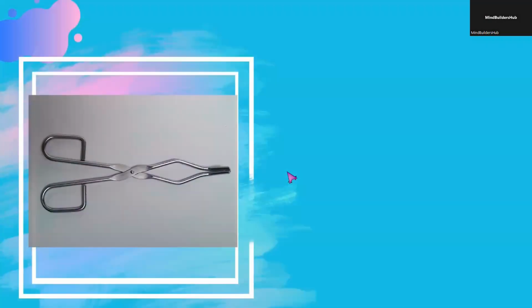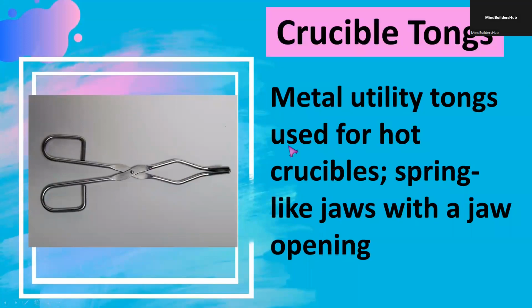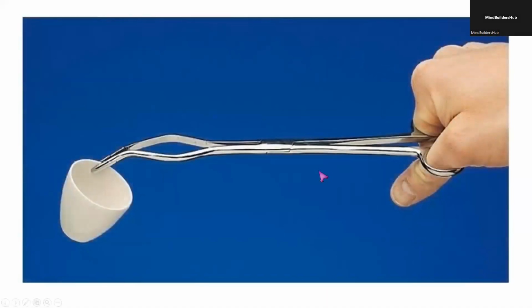Another type of tongs is, of course, the crucible tongs. From the name itself, it is used for a crucible with cover. Made of metal again, utility tongs used for hot crucibles. It has spring-like jaws with a jaw opening here. This is how you can use the crucible tongs.